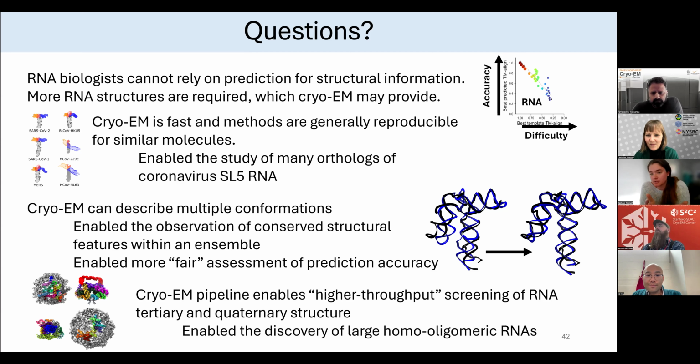They're quite low resolution, right? So, for example, you don't see the separation of the stacking of the Gs. But you can use crystal structures, going back to the other answer, of those G quadruplexes and place them in the density and then get a better idea of the global structure of your full thing with the G quadruplex. So certainly possible and has been done.